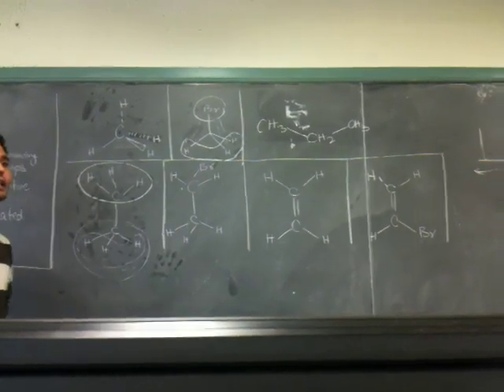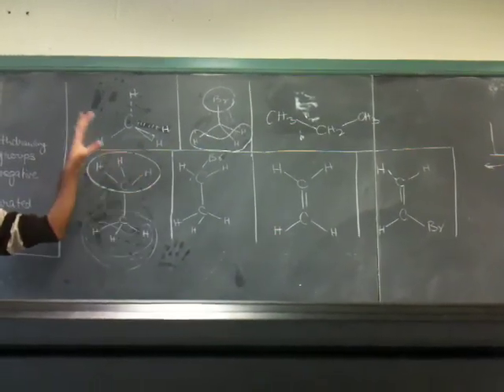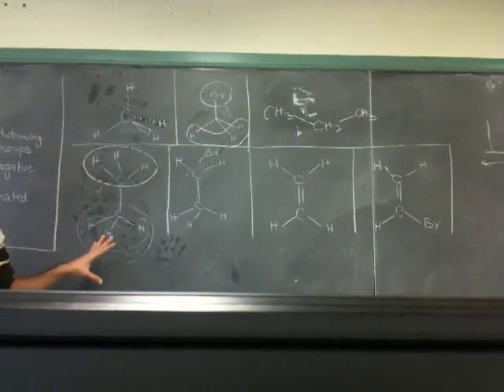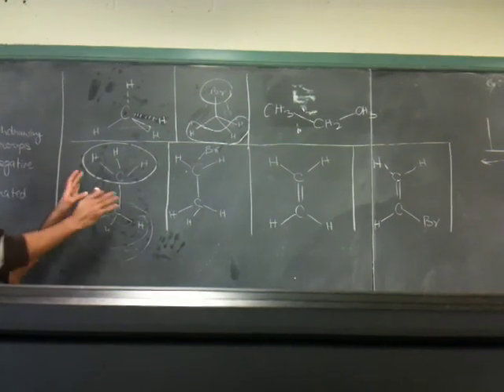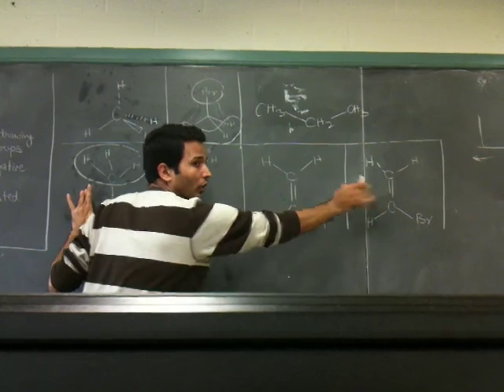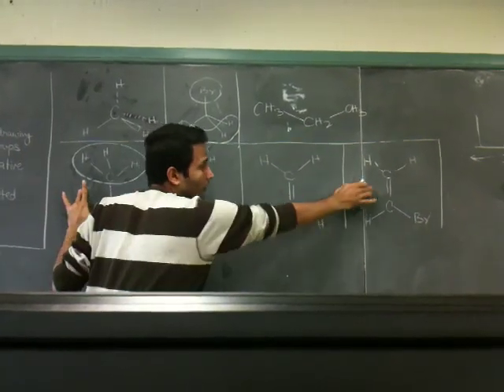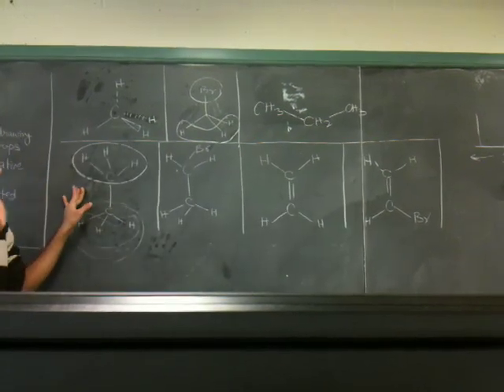They are making an identical set of protons. They are in an identical chemical environment. This example will become even more clear when I come to these other examples. What I mean to say will become clearer when I walk you through them. So just wait for a second.